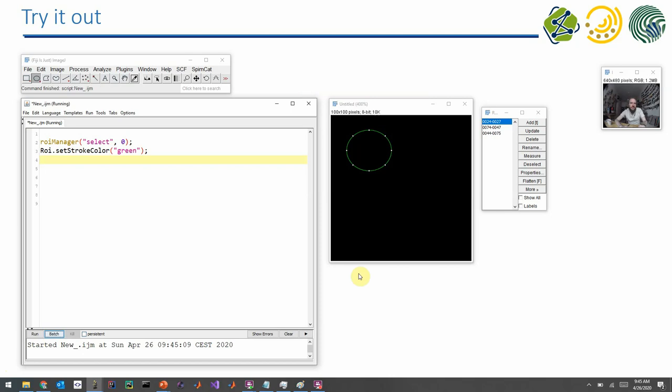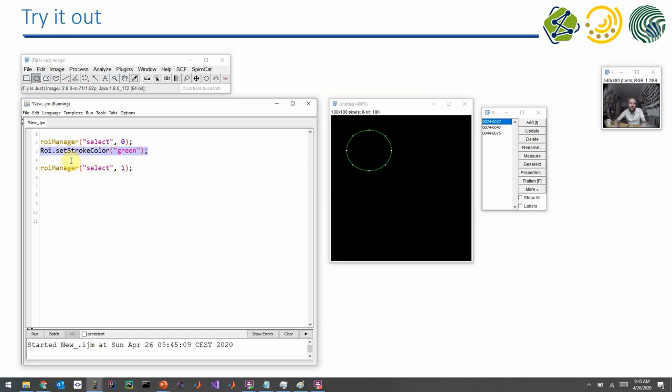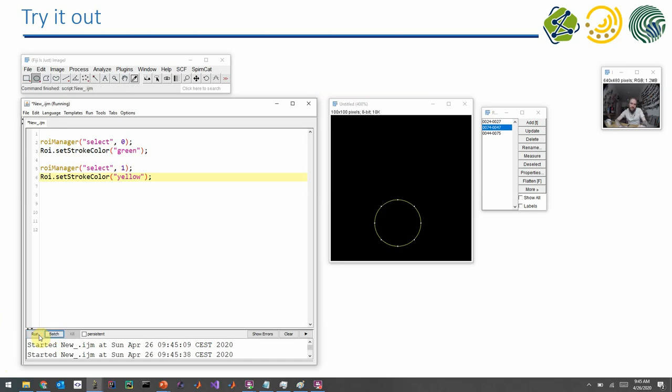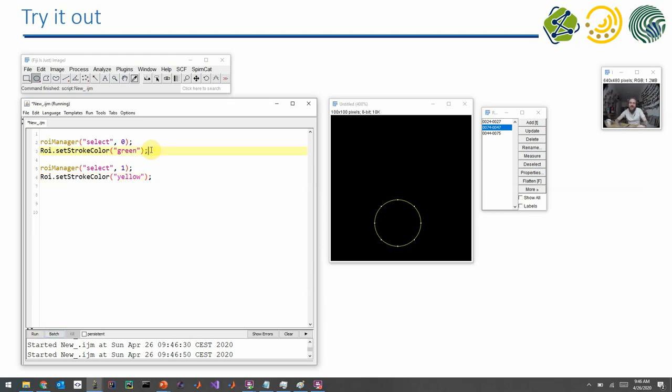Now I will make the second one, second one index one, and I will make it yellow. And here we now only see the second one. Because in this coding way, when you would change properties of ROIs and you want to select them individually and do something with them, you can only select them individually. So you cannot have them all visible at a time.